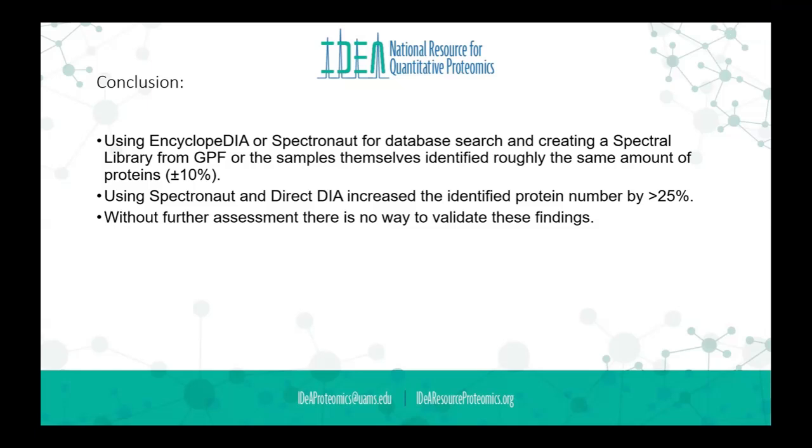Thanks, Dennis, for going through that. That's a lot of work, and you've kind of convinced me about the merit of staggered workflows in this day and age. Like, is it worth going through all the extra trouble when the instruments nowadays are capable of acquiring data at that speed? But with this growing number of protein IDs with experiments, whose responsibility is it for the accuracy or the trueness of the data? Is it something that core directors take on and sign off on, or is it something that they encourage the downstream collaborators to follow up on?